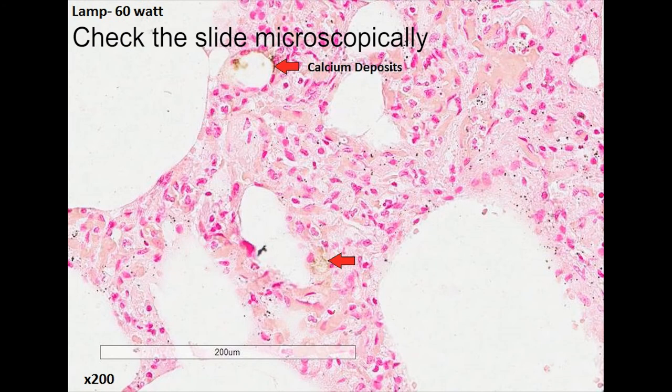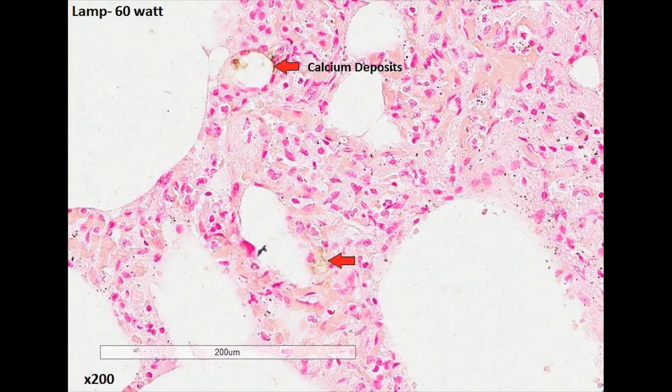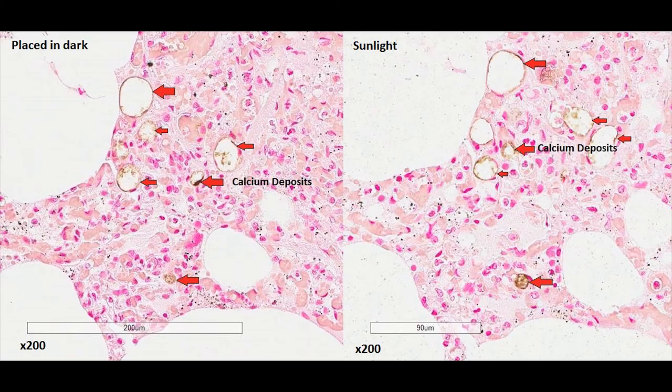This is an image taken for the section that was under the 60 watt lamp. We can see the calcium deposits presented by the brown color that are present. We can also compare the sections placed in the dark and sunlight.